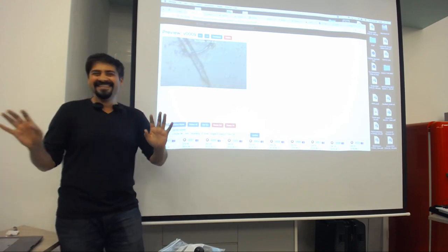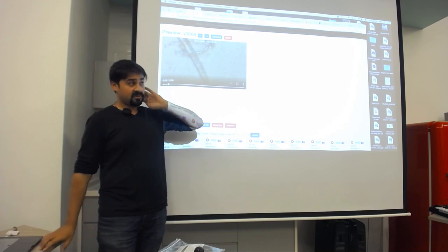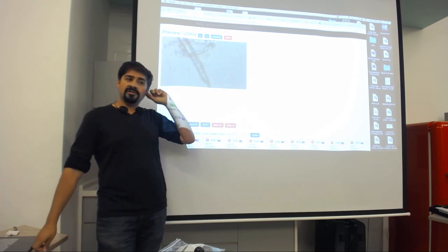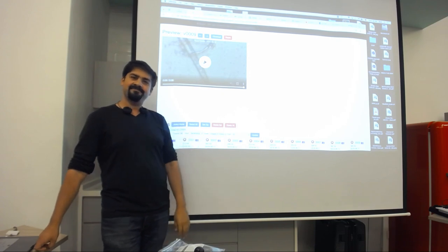So there are no scientists in the room. So the best guess for what that little thing is running around is a rotifer. I've been told that rotifers are in everything. I don't know what a rotifer is. You'll have to look at Wikipedia for that one. But they move, and you can take videos of them using this camera.